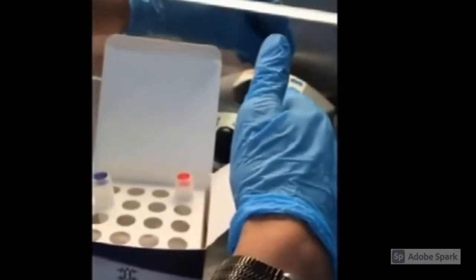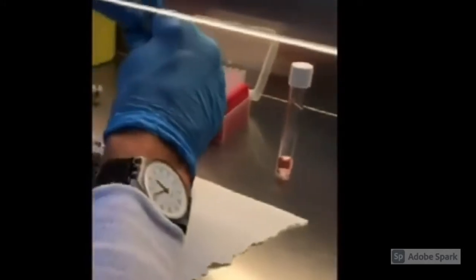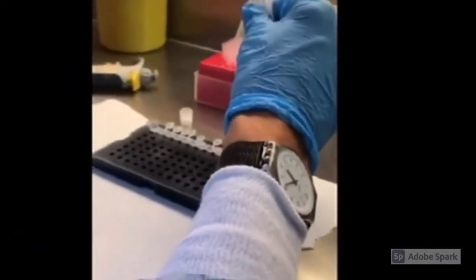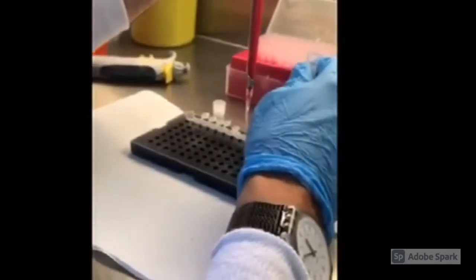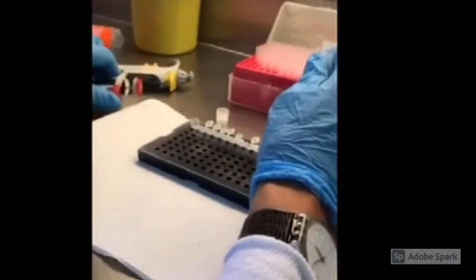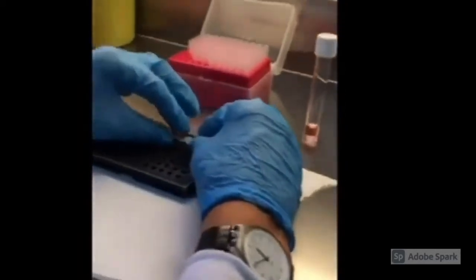And then we again vortex the primer mix again in here. This is the primer for Gen N, and we again put 4.5 microliters of this primer mix to tube 2. And all mix is ready now for one reaction, one test.